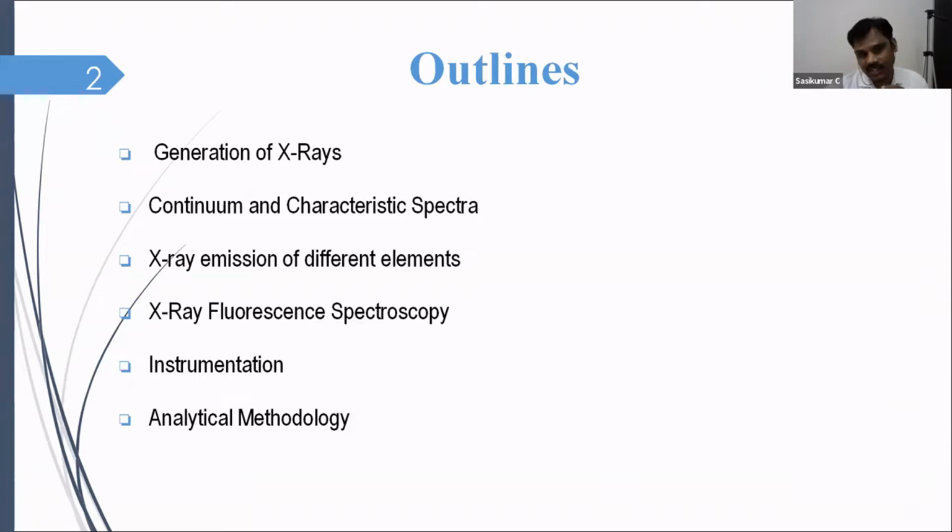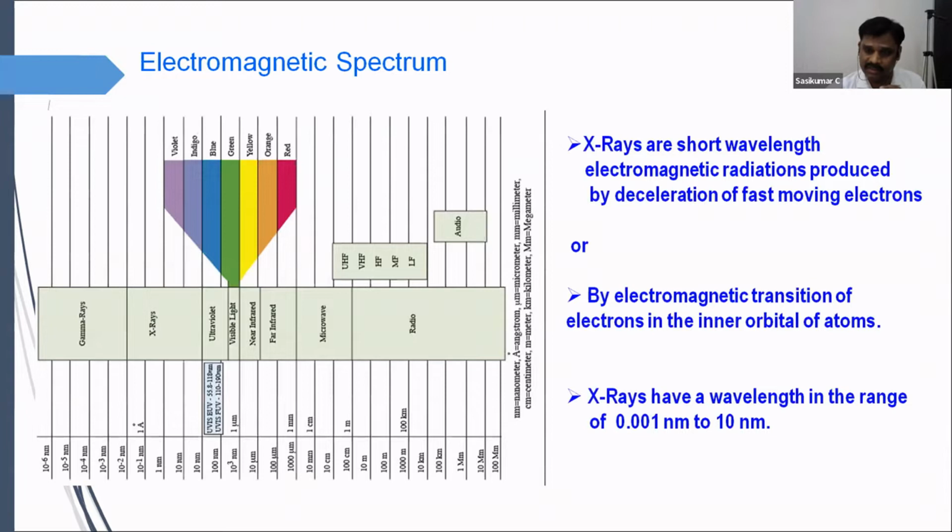So in this lecture, I'll be covering X-rays, how they are generated and what the continuum and characteristic spectra are, and how X-rays are emitted from different elements, XRF and its instrumentation. And most importantly, I'll be talking about analytical methods.